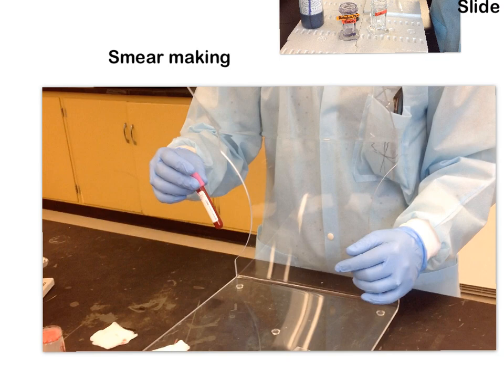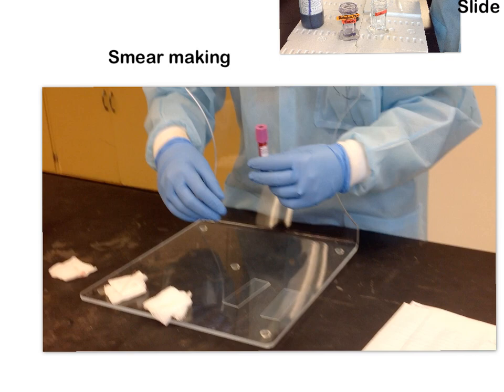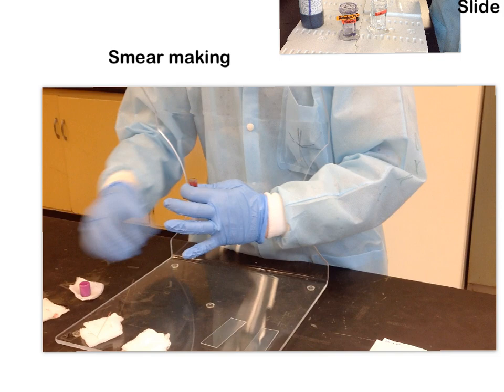We're going to take our well-mixed tube of blood. We want to avoid aerosols — I'd prefer that nobody splash blood into their eyeballs, so put your goggles on. We are always going to uncap our tube of blood behind a shield. Grab a few pieces of gauze and twist and pull on the cap.